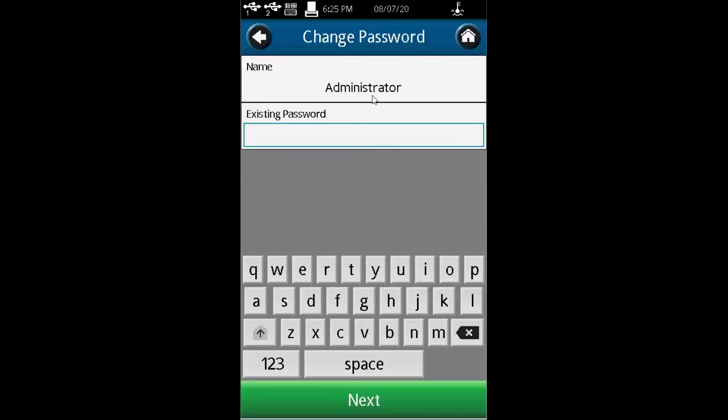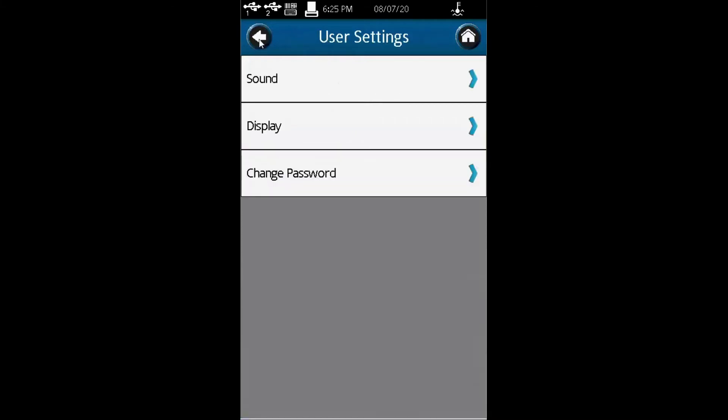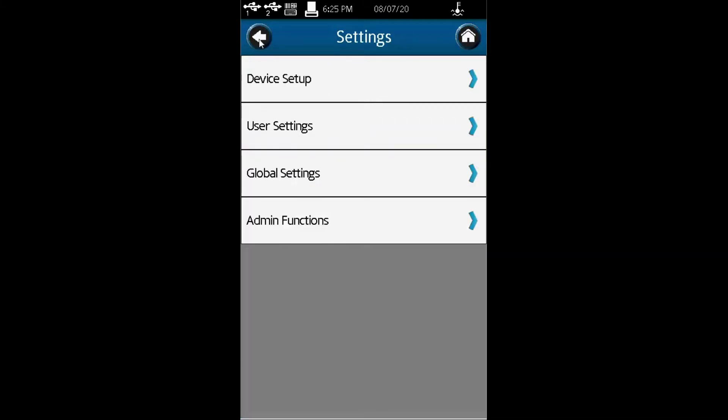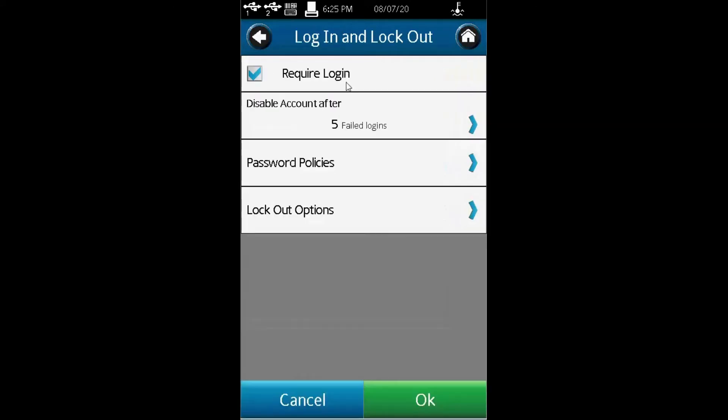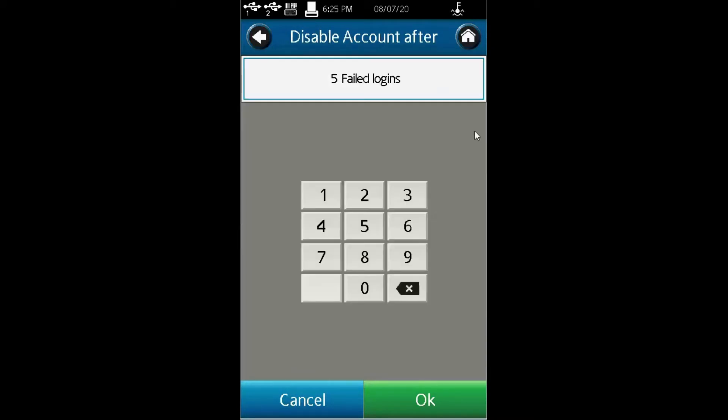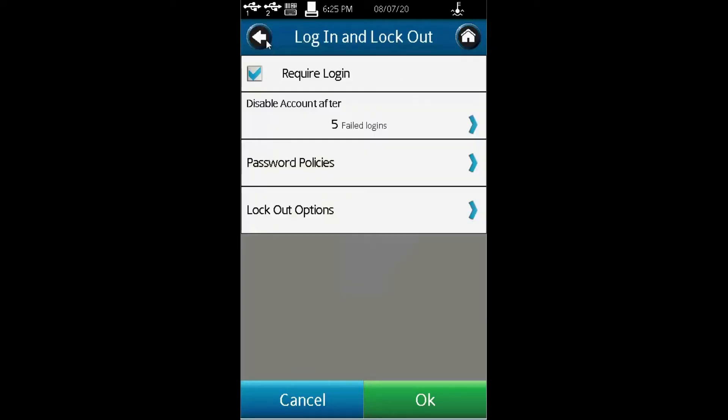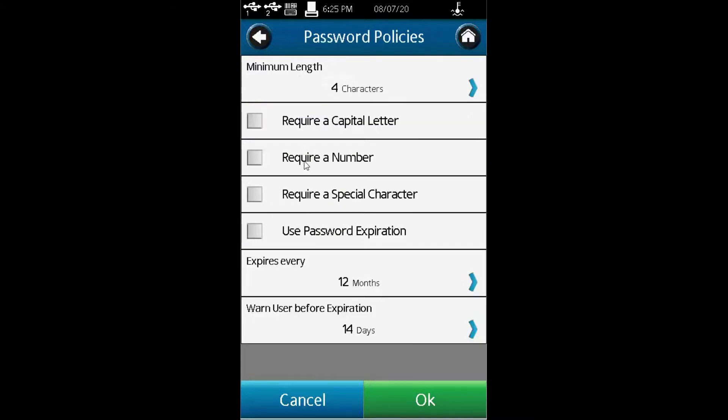If you're an administrator, you can change your password from here. Under admin functions, this is where most of the functions are. You have login and logout. This function allows you to disable accounts after a certain number of failed login attempts, set password policies, require capital letters, and use password expiration.